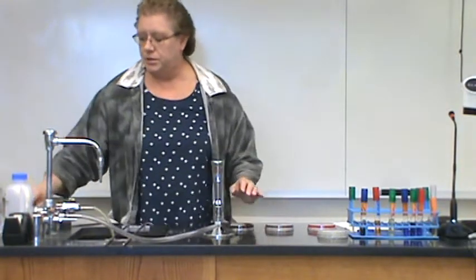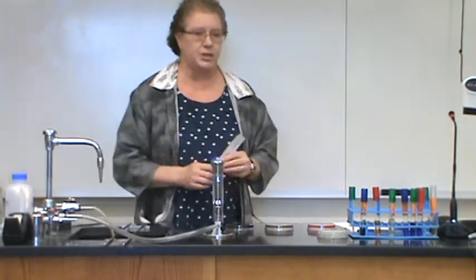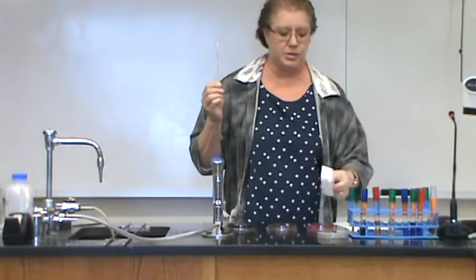So you are going to need your Bunsen burner lit to create an aseptic environment. And then to inoculate these plates, you need a sterile swab. Remember, these are all selective and differential medias that you have used already. To inoculate, you'll peel the wrapper down so that you have the handle. Your swab is sterile. Remember, you don't put this in the flame, just provide an aseptic environment for this procedure.